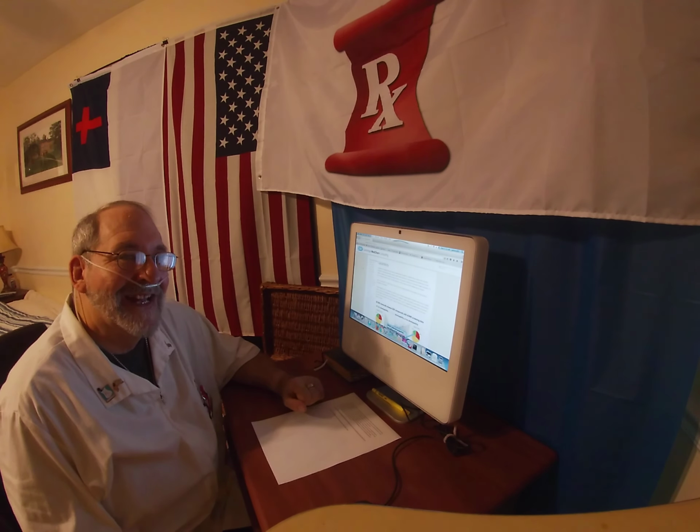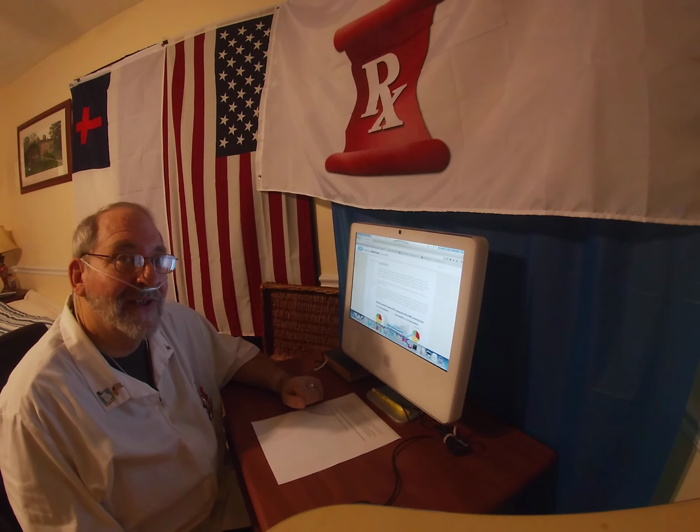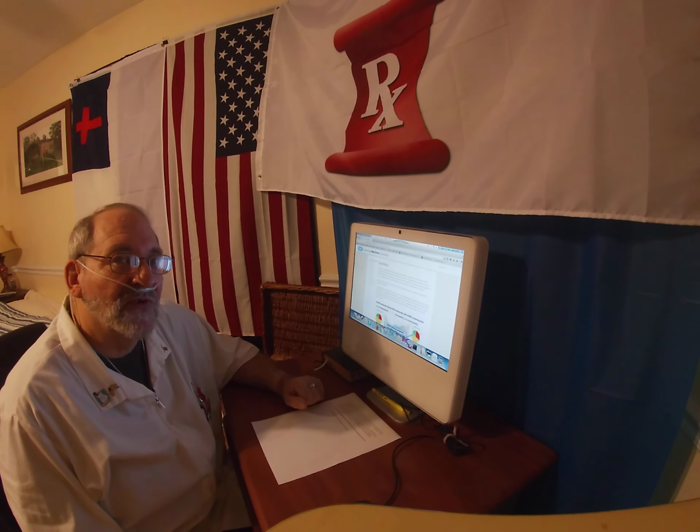Hello. I thought I'd follow up on the assignment for lab number 6 on the case study about compounding diazepam suppositories. The pharmacist used cocoa butter as the base for the diazepam suppositories, and the patient didn't respond and was still having seizures. The question was posed: was that the right base?